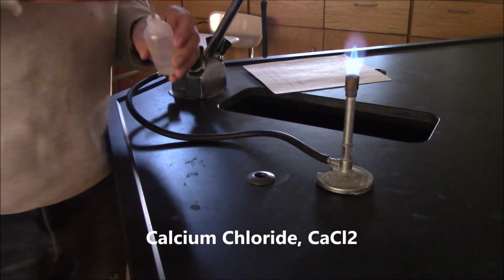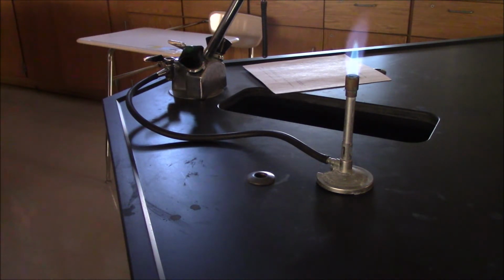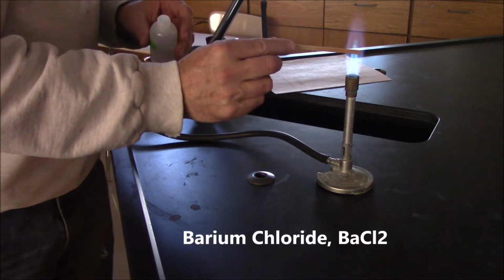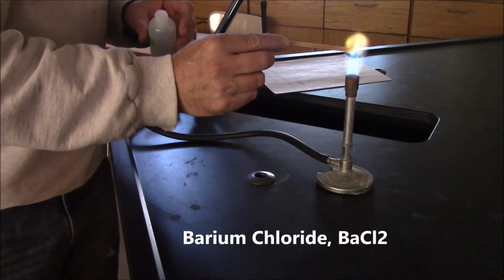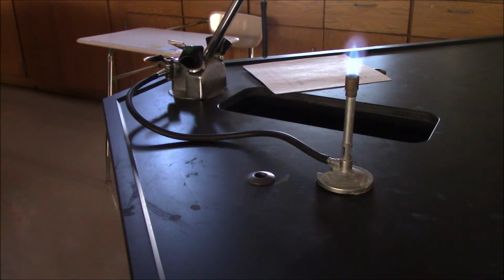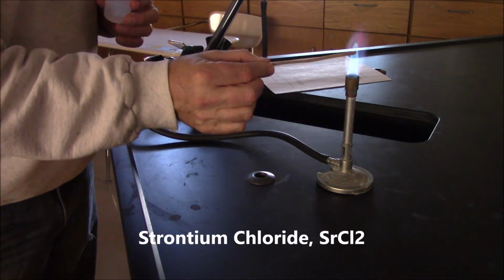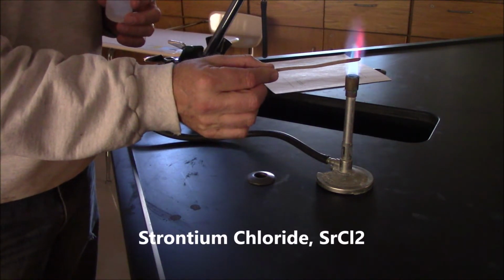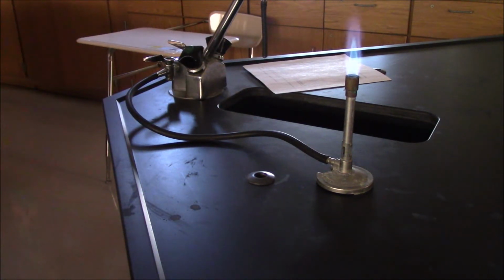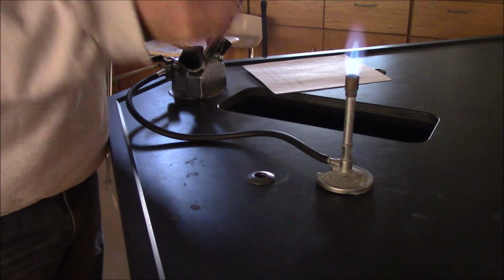And you might notice sometimes it can be hard to tell some of these apart from each other. So when you get to your unknown, it might be you can't tell perfectly. Here's some barium chloride. Strontium chloride. And last, for the knowns, cesium chloride.